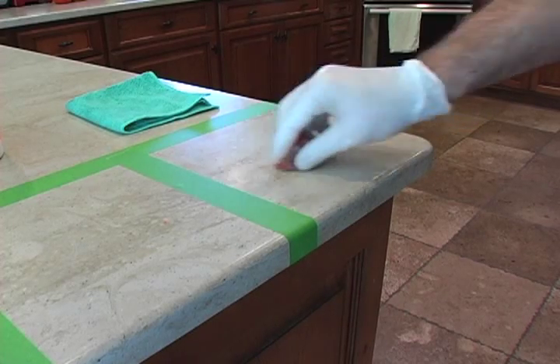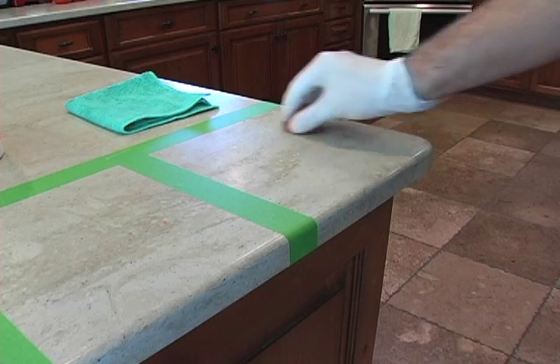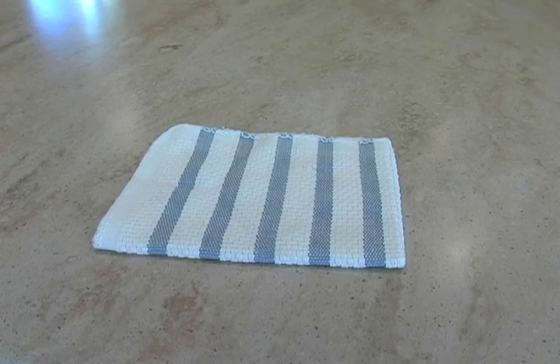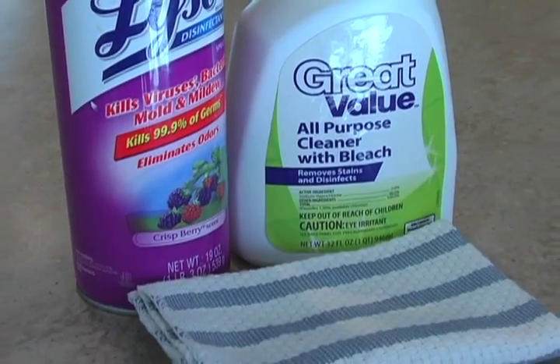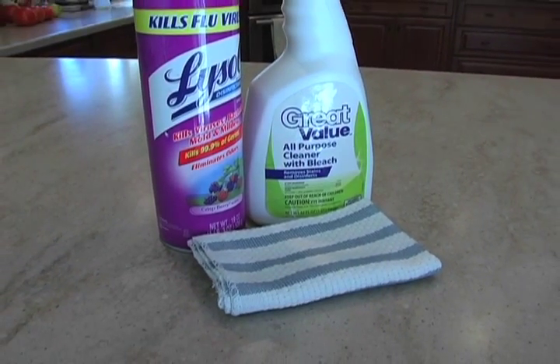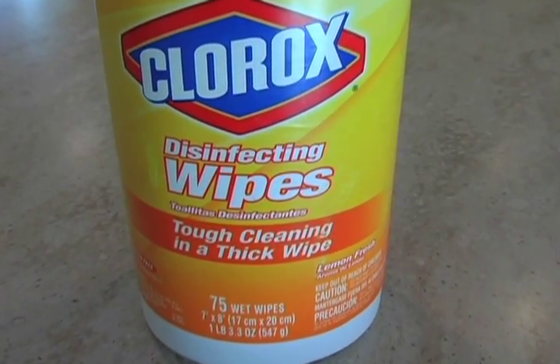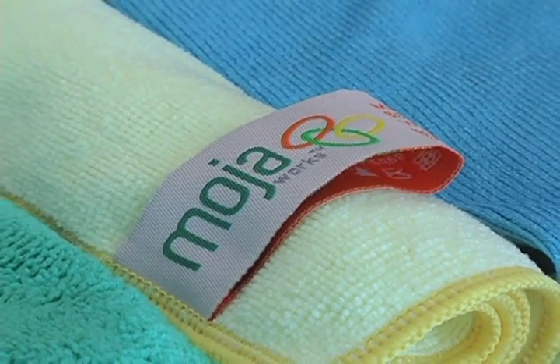Our four contestants today in the biofilm bonanza are: a standard cotton cloth, followed by Lysol disinfecting spray with a standard cotton cloth, then Clorox disinfecting wipes, and finally a Moja fiber cloth from Moja Works.